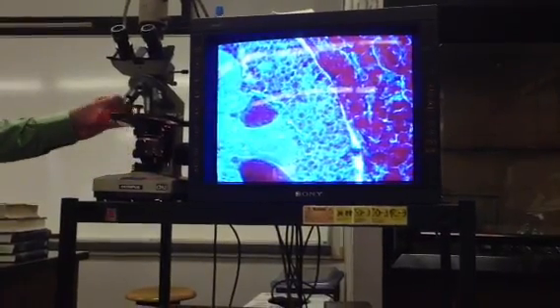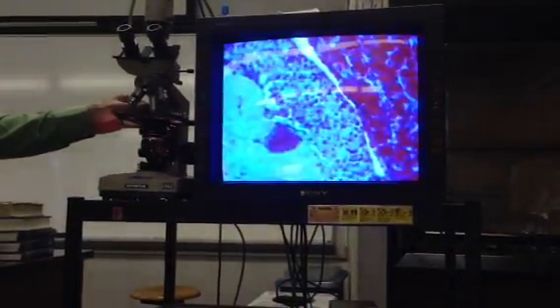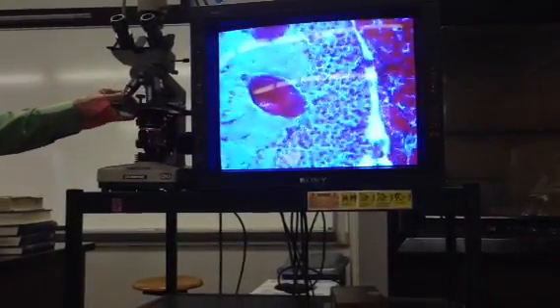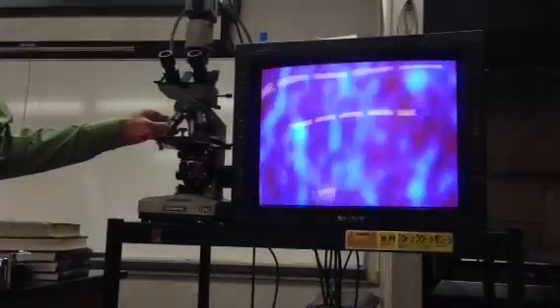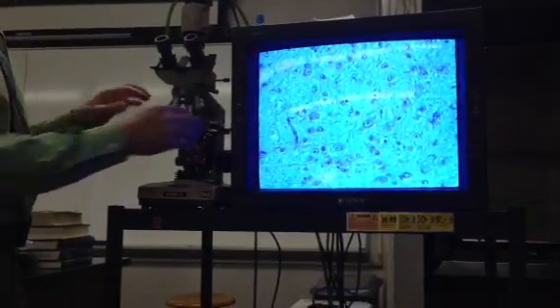Right? And if I ask you about the posterior, so hopefully, if I show you it under high power, I will definitely provide the context so that you can tell it's the pituitary, which you'll know just from the color. But if I'm pointing over here instead of over here, you'll know that it's not a trophic hormone, obviously. Okay, so that's basically that slide. We didn't really do any specific histology of the hypothalamus area, so I'm not going to ask you about that.